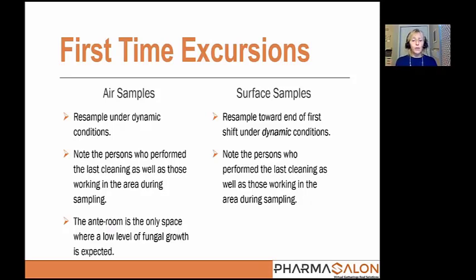Ultimately, what you're going to end up doing is taking a look at those results and seeing what you get back. If you're back within a state of control, it might have just been that one blip, no big deal. You took a couple steps maybe to mitigate additional risk and it's all documented, you're done, you move on. Not that big of a deal.